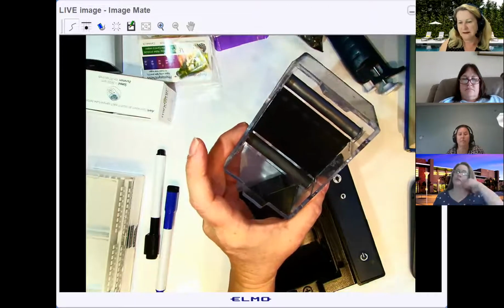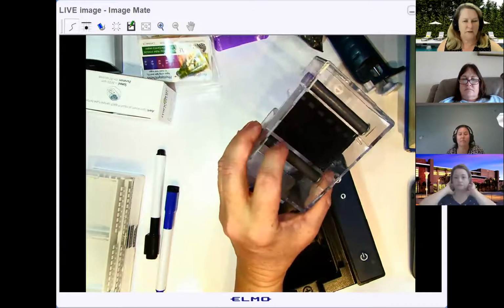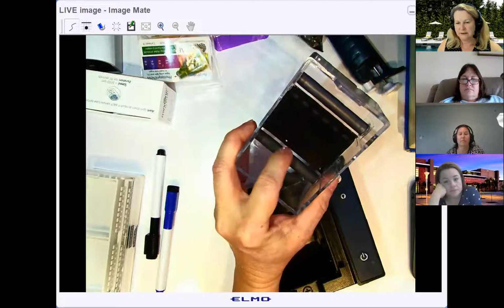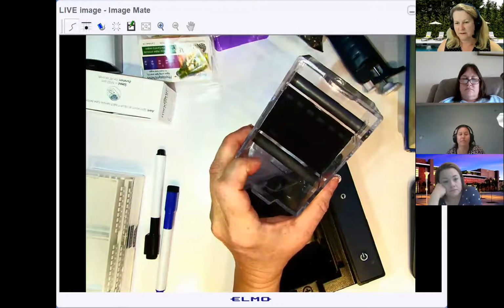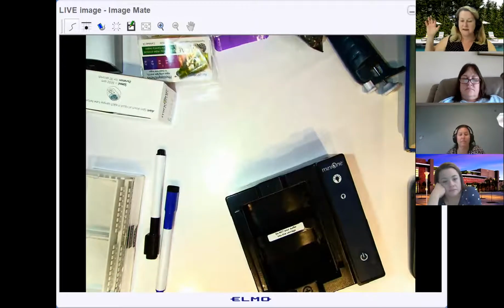I've been teaching, gosh, 30 years now. And every once in a while, some kid would get a little overeager when they were cleaning out the gel box at the end, and then they'd break that platinum wire, and those are expensive and a pain. The other thing I really like about this MiniOne system, and I get nothing from MiniOne, I don't get a commission or anything like that.